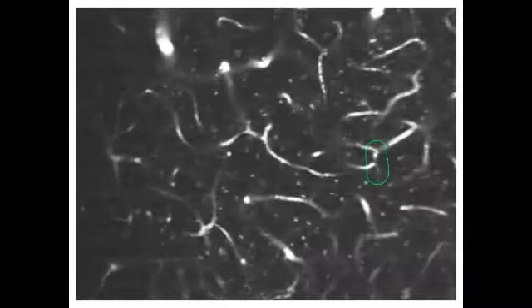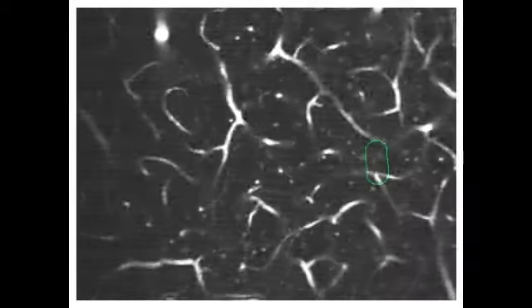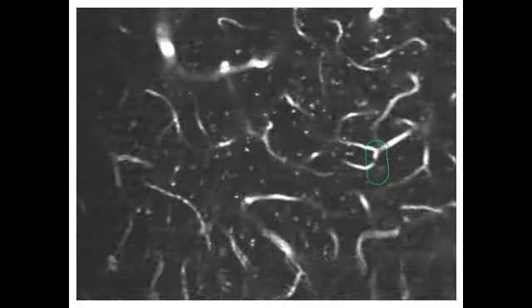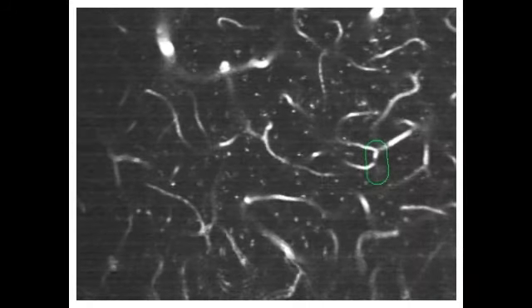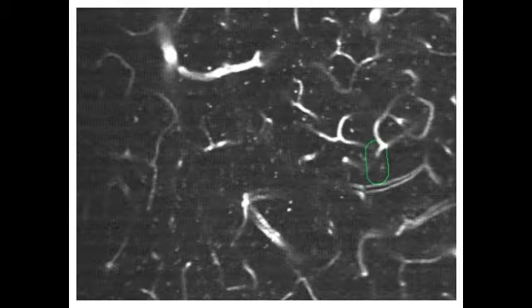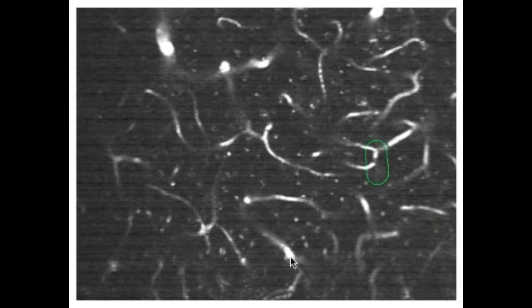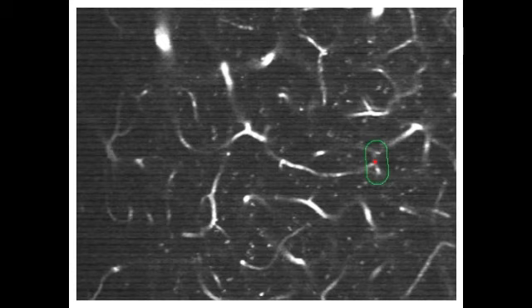This is a bit of an unusual vessel in that you can see a number of intersections — spots where different vessels come together — all within the green outline. That's atypical. Typically it's just a single vessel that follows the shape of the outline. Here, you can see there's one spot that doesn't move as we look through the layers of the vessel. As we scroll back and forth, that spot remains constant. So we'll call that a stall, and that was correct.